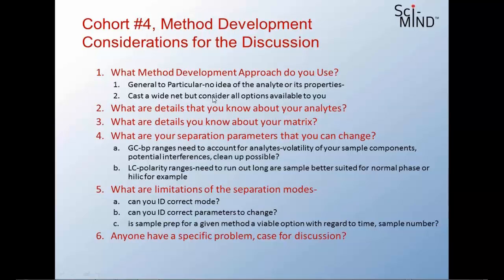Right. So while you're thinking of questions to post, the important thing is that sometimes you run into a situation with LC, for example, where you're trying to dissolve your sample, and it's just not a water-soluble sample. And everything you've done in your experience tells you that reverse phase is the way to go. And currently there are a number of options for you.